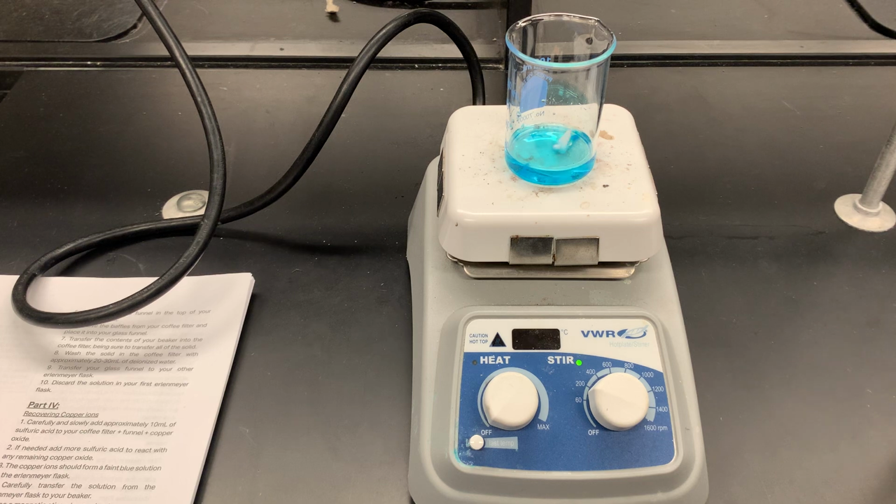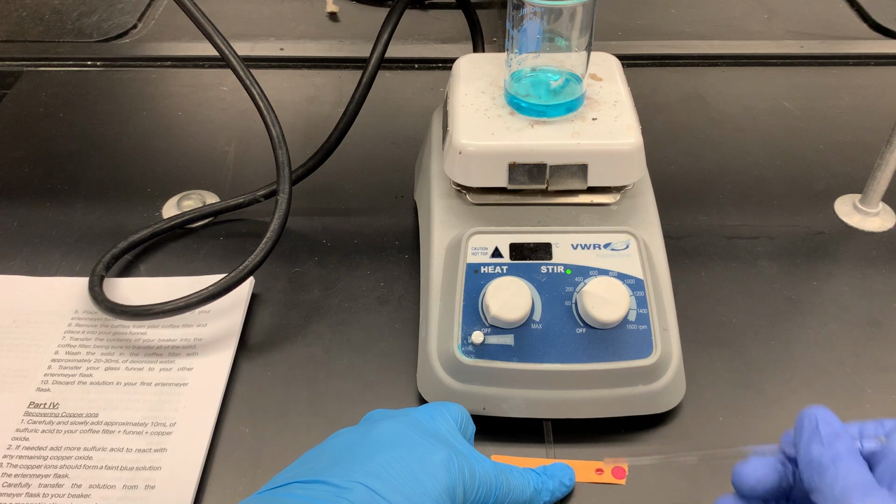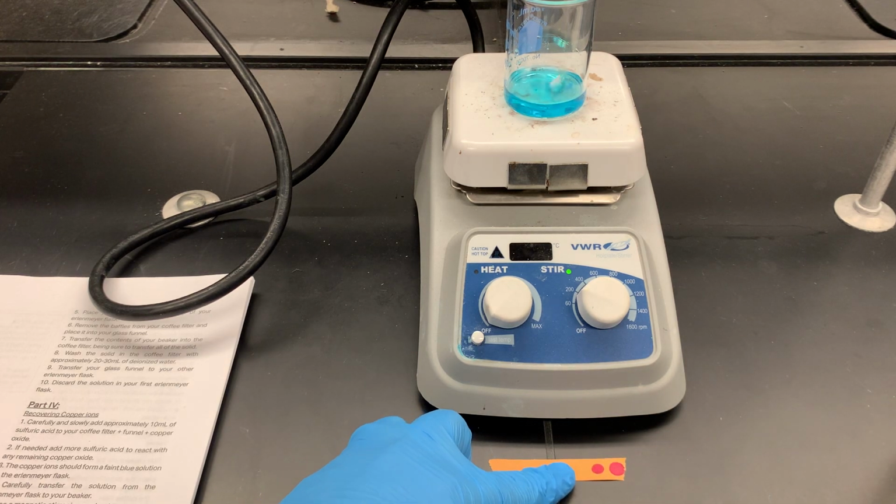And what we want to do now is check after 5 drops, has the pH of our solution changed? And if you keep using basically the same piece of pH paper, you can see that, well, those two solutions haven't really changed that much.